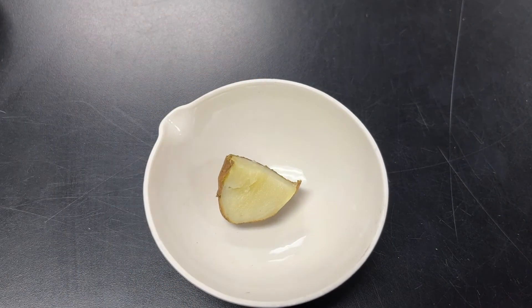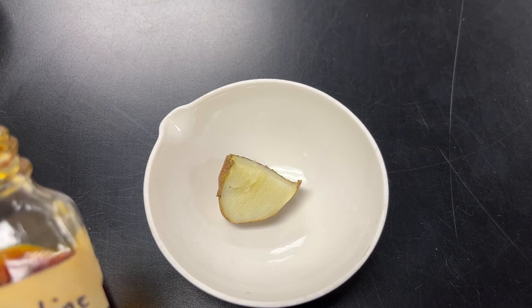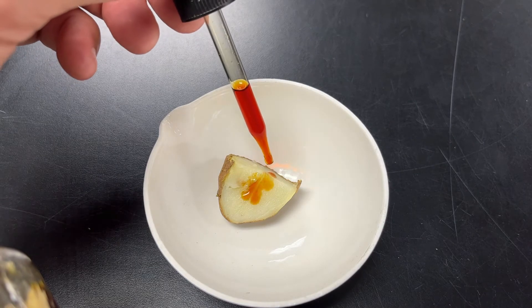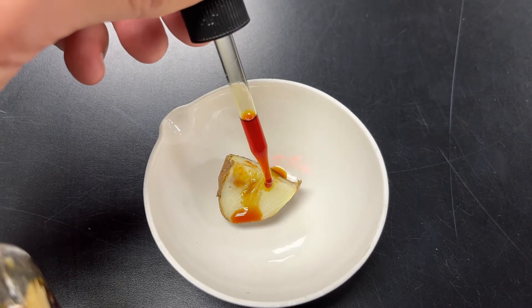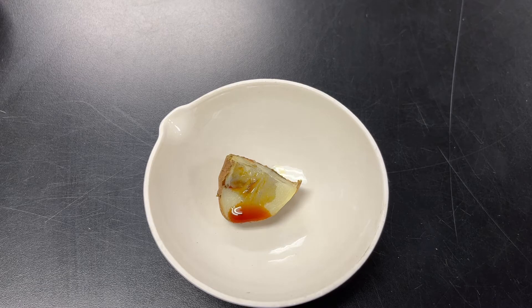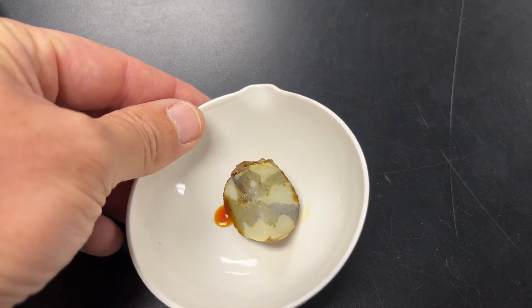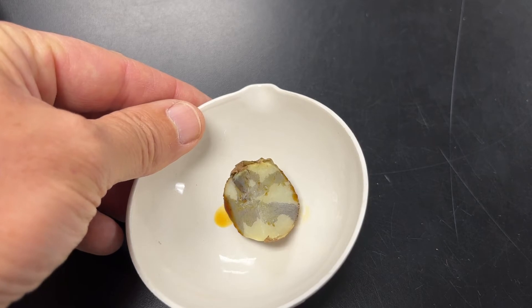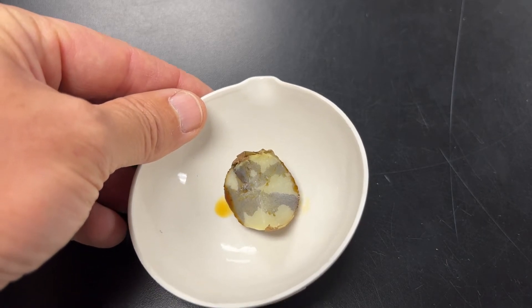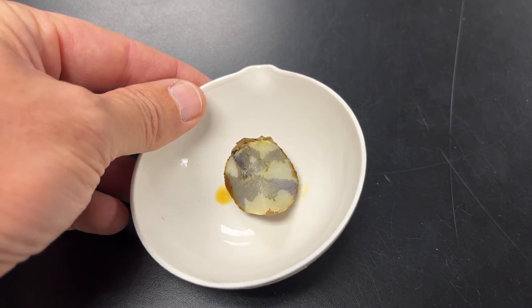Let's test a potato. This is a baked potato. I'm going to take some iodine in the dropper and put a few drops on it. You can see at first it is brown, but I can see that areas where it has already soaked in, it is turning black. This indicates that a potato has starch in it, which again is sugars that are linked together.